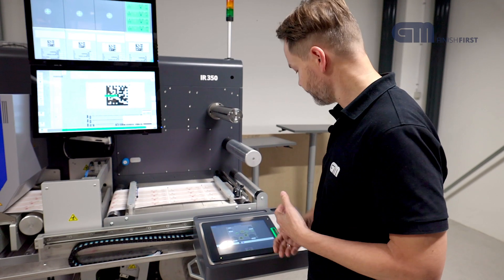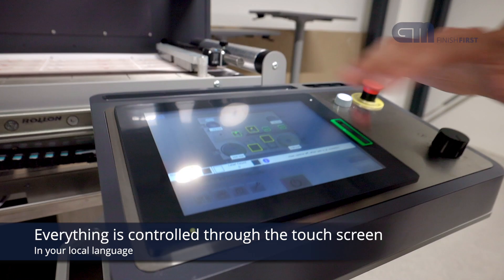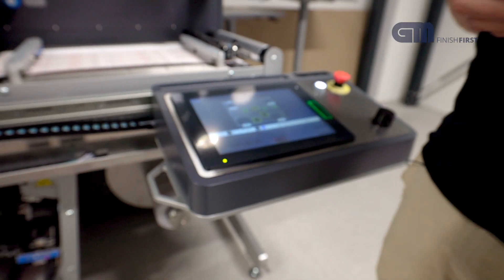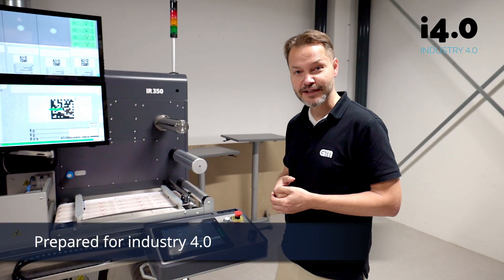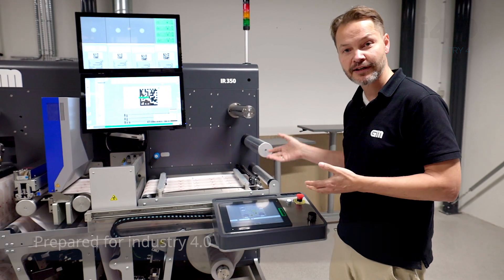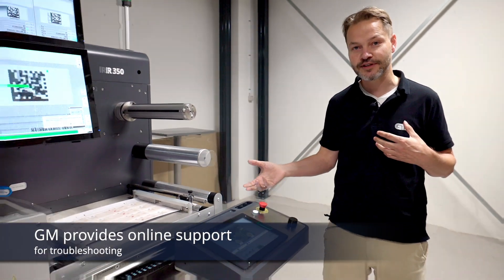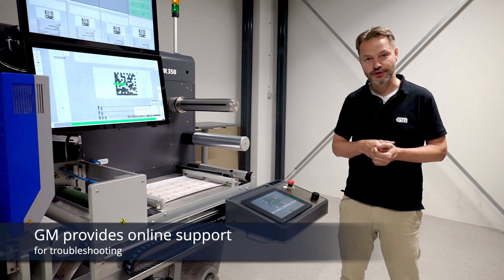Everything is controlled with a very nice touchscreen graphical display, so you can see your web app in the local language. The machine is, of course, Industry 4.0 compliant — that means that in some countries you can actually get a state grant or benefit by buying this equipment. From a service perspective, it also means that we can be right there with you instantly. When the machine is connected to the internet, our engineers can look into the machine and help you troubleshoot problems.